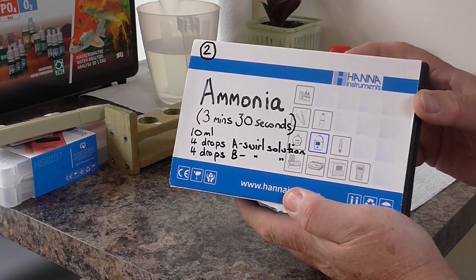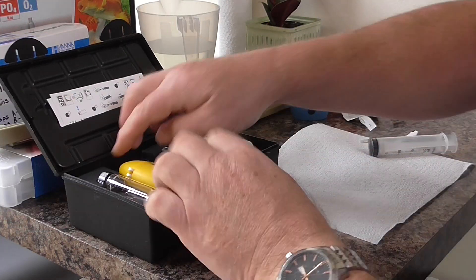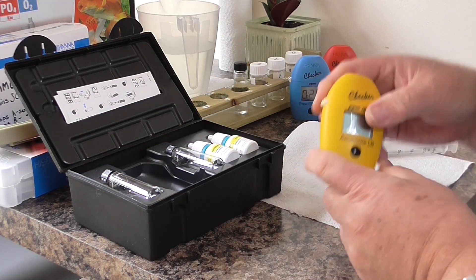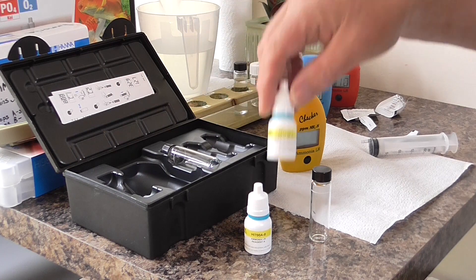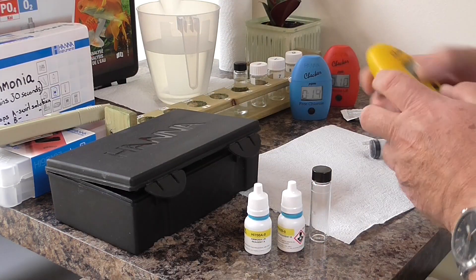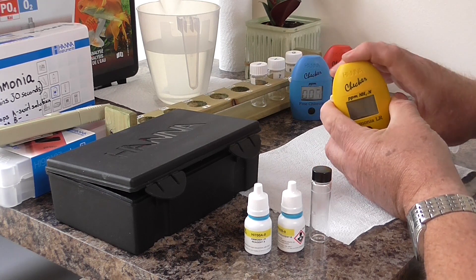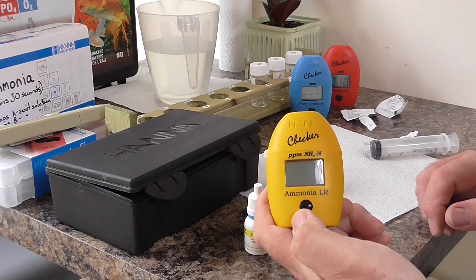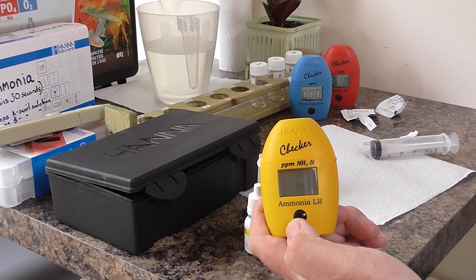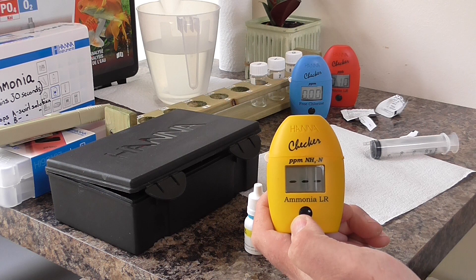Again we've got the meter, test tube, and this time we have two lots of liquid reagent. Open it up, drop in the clear pond water. C1 — so we'll press, wait until it says C2.